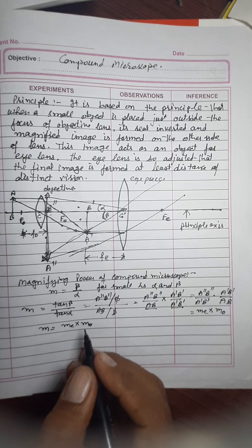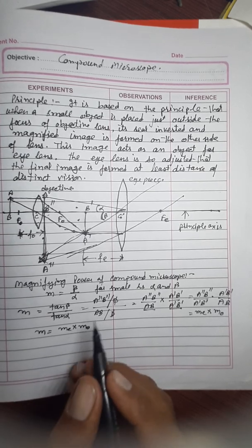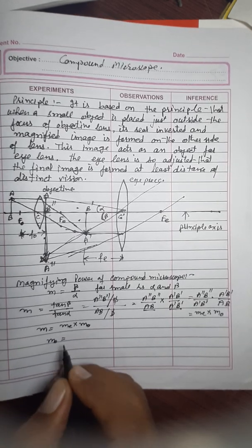M_O is the magnification of the objective.